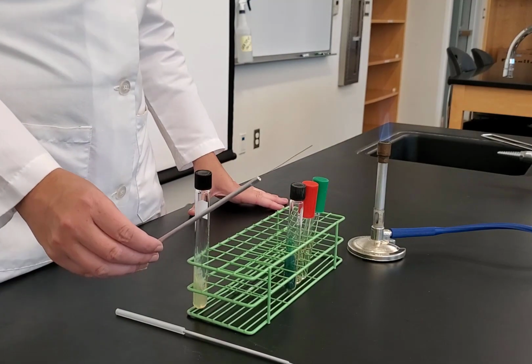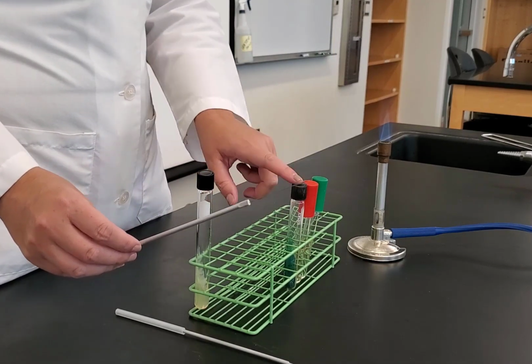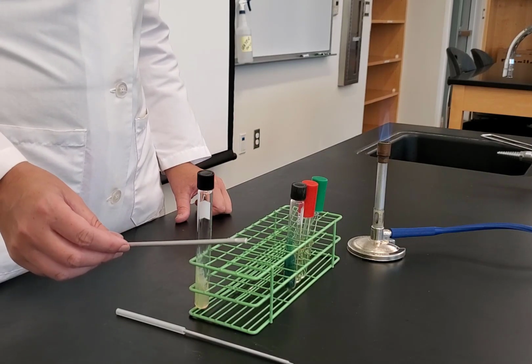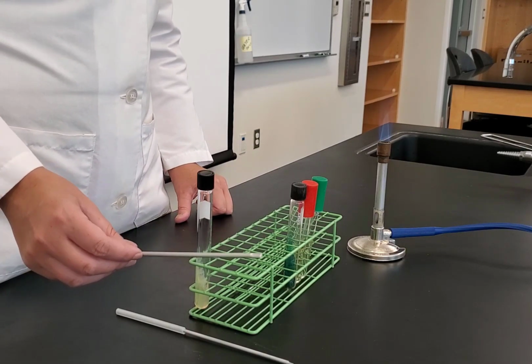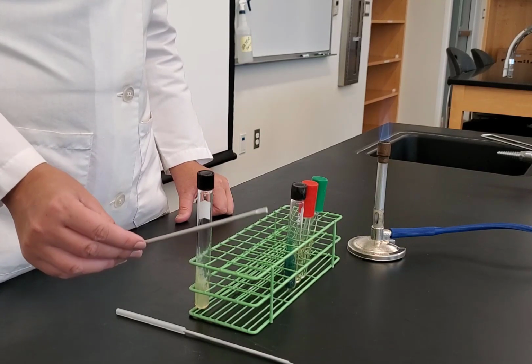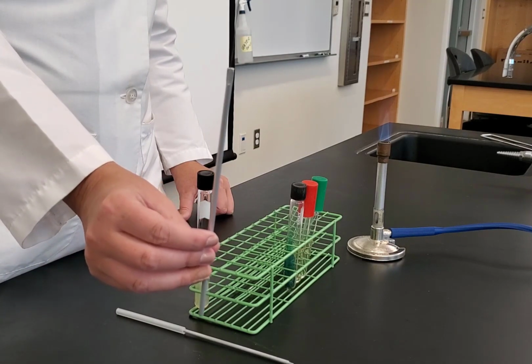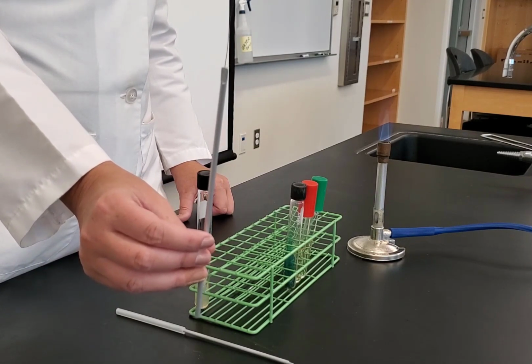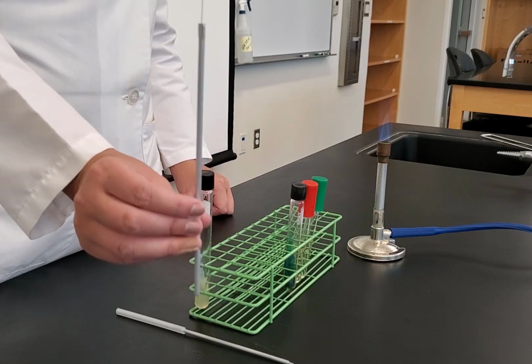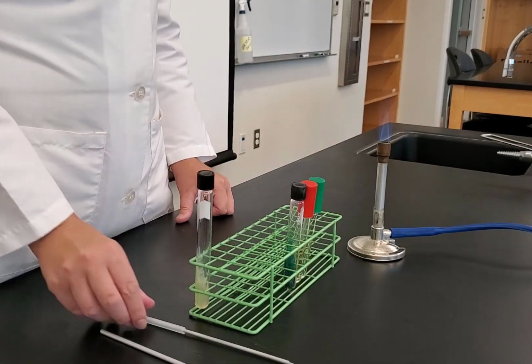However, the citrate test is a little bit different. In the citrate test, we want to only inoculate lightly, because if we have a heavy inoculation, it's going to affect our results. I'll explain why later. So when we inoculate a citrate slant, we are going to do so using a needle. So we're not going to do our zigzag inoculation with a loop. Instead, we're going to do it with a needle so that we don't pick up too much bacteria. So let's start with the broths first.